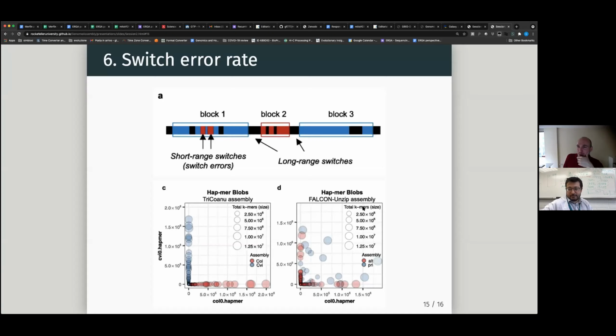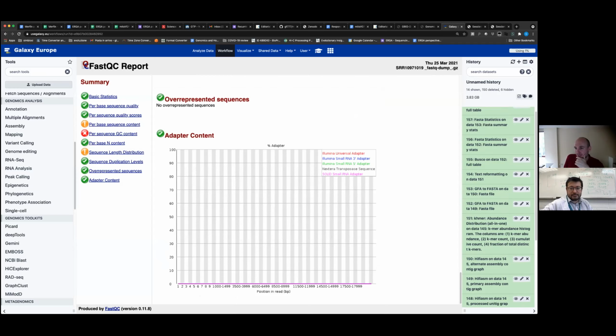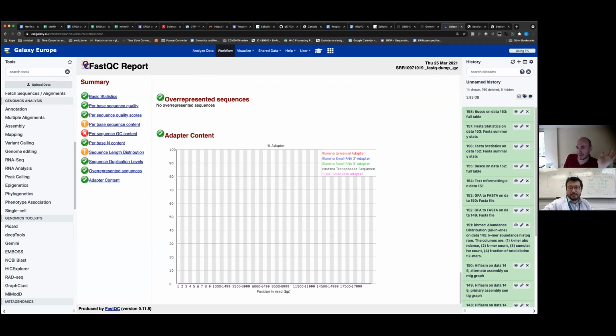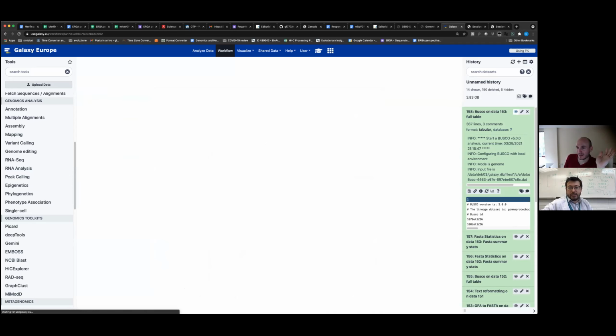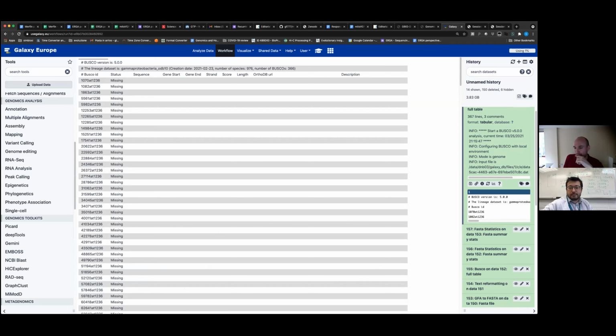Okay. So probably, as I said, we can finish earlier. I think my run is also completed. Let me see my stats. Did you do E. coli as well? Oh, but I have the full table. Yeah, it's E. coli, but it's a full table. Okay, did we run the QV or the Phred score? Do we have that anywhere? No, because it doesn't.